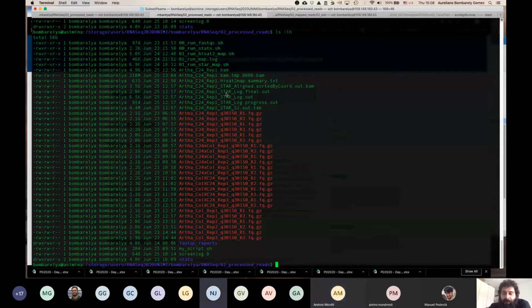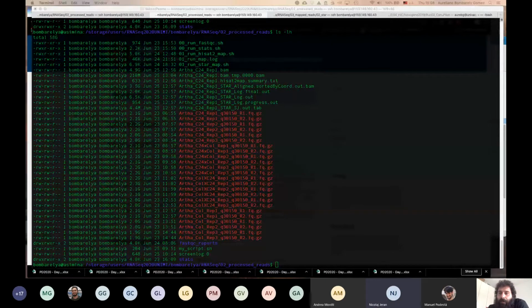Yeah, thanks. Please explain also why the outputs are slightly different in terms of the number of forward and reverse strands. Okay. Yeah. Okay. That being said, I'm going to stop the recording.